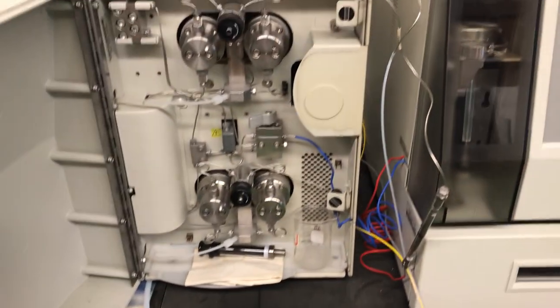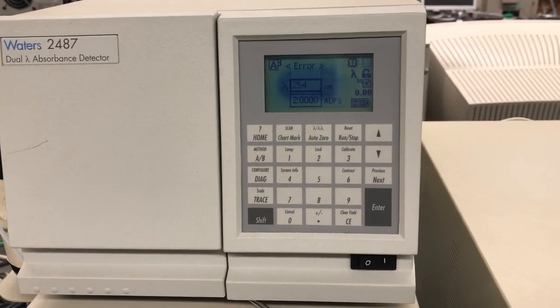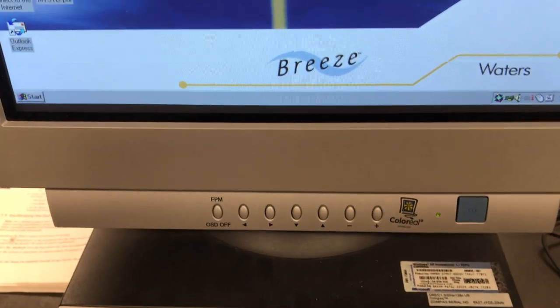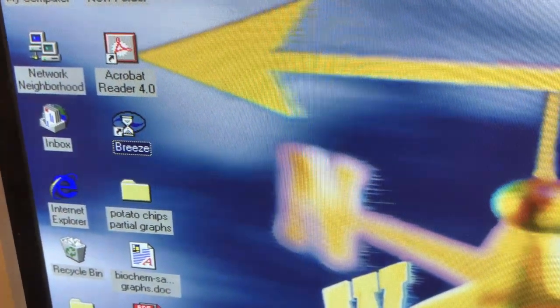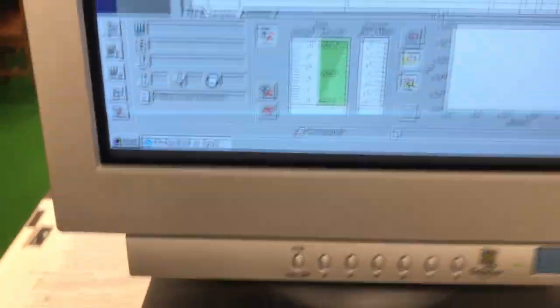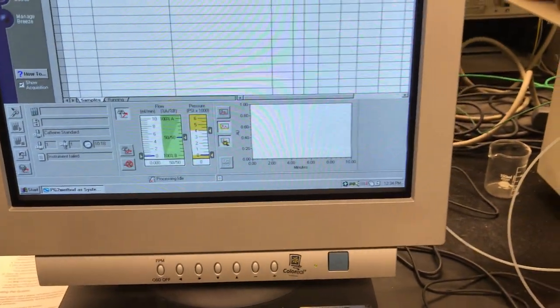To start the experiment, each component of the instrumentation will have been turned on: the auto sampler, the detector — set to the analytical wavelength of 254 nanometers, which is the wavelength at which caffeine absorbs strongly. We then come to the software and double-click the Breeze icon to establish connection and communication between the instrument and the software. After scanning for instrument components and setting parameters, the instrument handshakes with the computer and we are ready to get started.